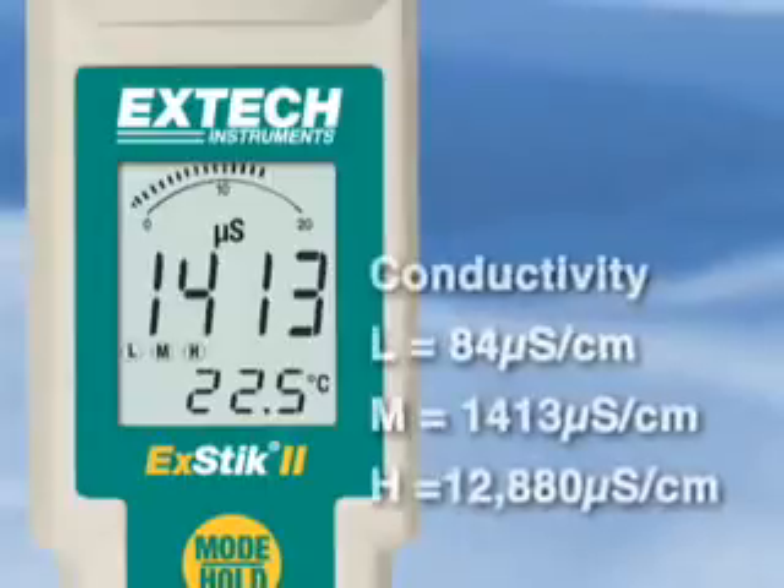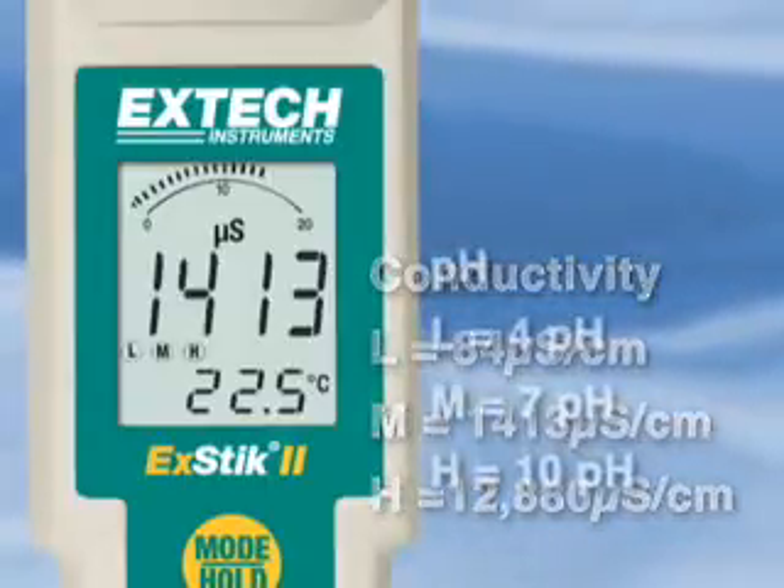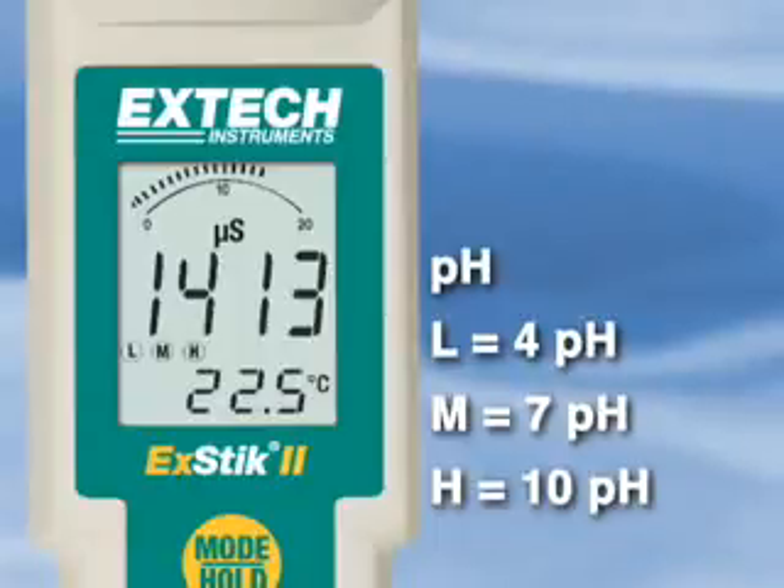The memory also stores your last pH or conductivity calibration, displaying L, M, or H — low, medium, or high — on the instrument's screen.